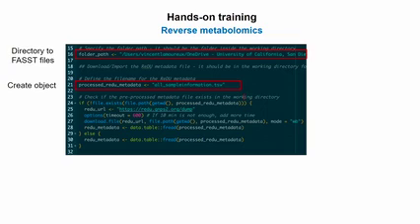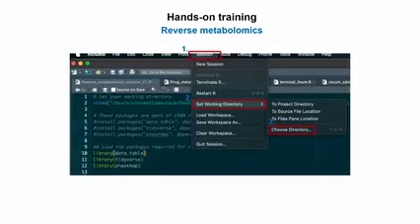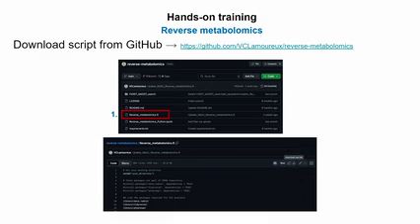So the first time you use it, in theory, this part of the code will download it into your directory automatically. So you don't have to go to REDU, you don't have to click on download, you don't have to drag and drop anything. It will do that automatically and the script will work. But the problem with the internet today is that I think most of you will not be able to download that fast enough. So if you just go back to the GitHub account, we already put a zip file for the REDU metadata.